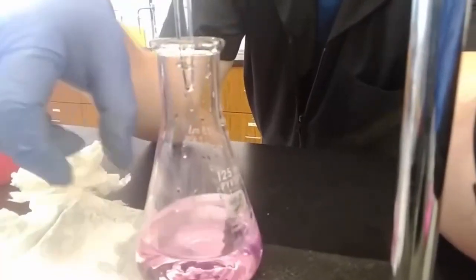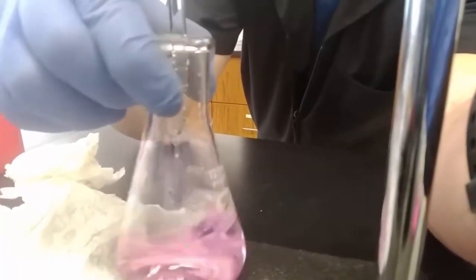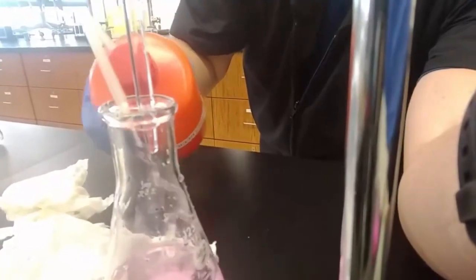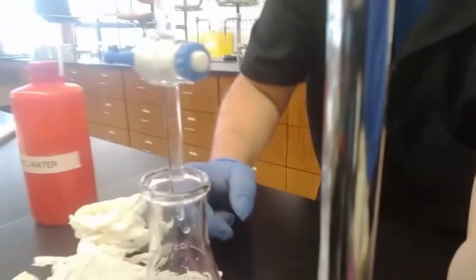Third drop did it, didn't it? Lightest shade of pink possible. Double check, rinse down the side of the flask. Just make sure everything is washed down in. Definitely still pink. I need my final reading, again, in the way.